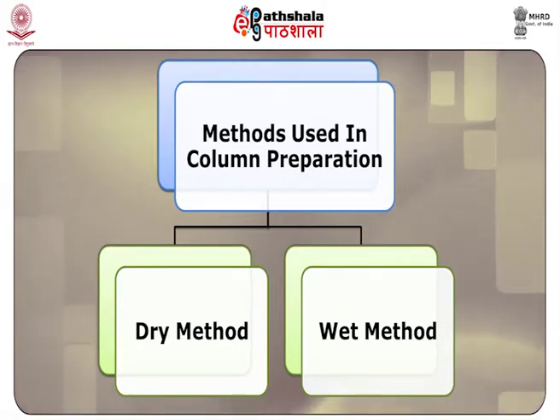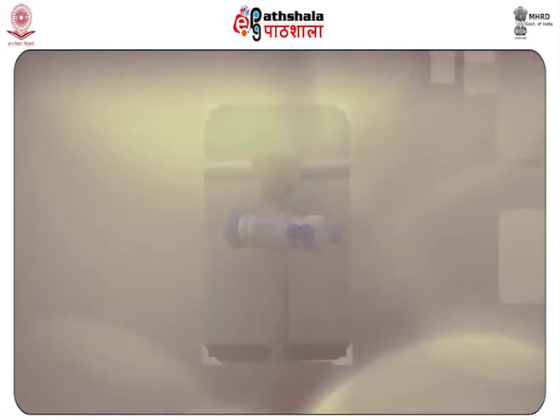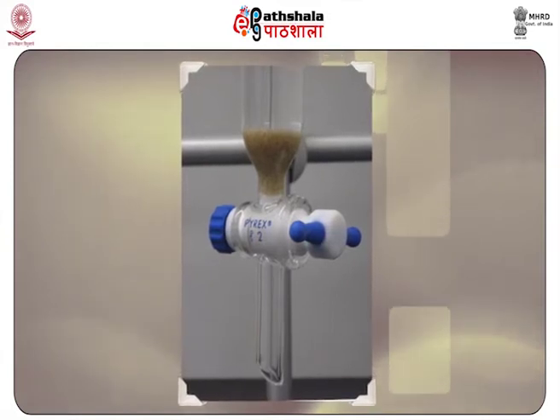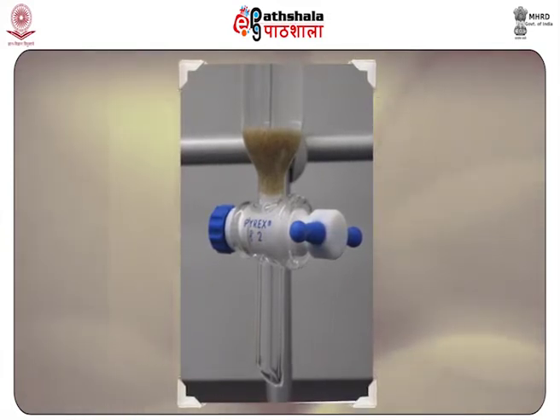In the dry method, the column is filled up with dry powder that constitutes the stationary phase. After this, the mobile phase is made to pass through it until that powder becomes completely wet. For the wet method, a slurry is made by mixing up the powder of a stationary phase and the eluent outside the column. The slurry is then carefully packed in the column. Proper care should be taken so that bubbles are not formed during this packing.